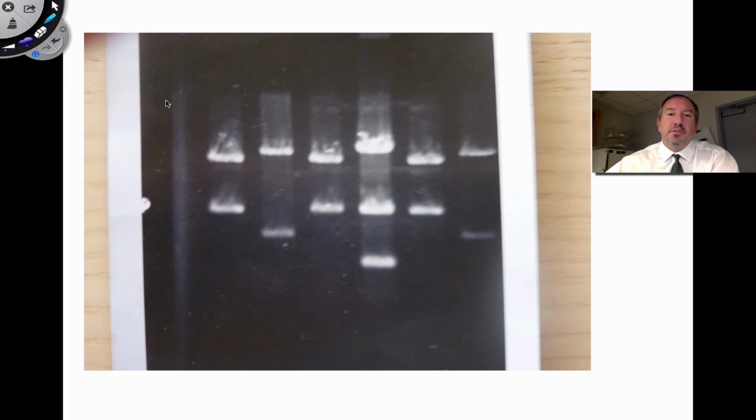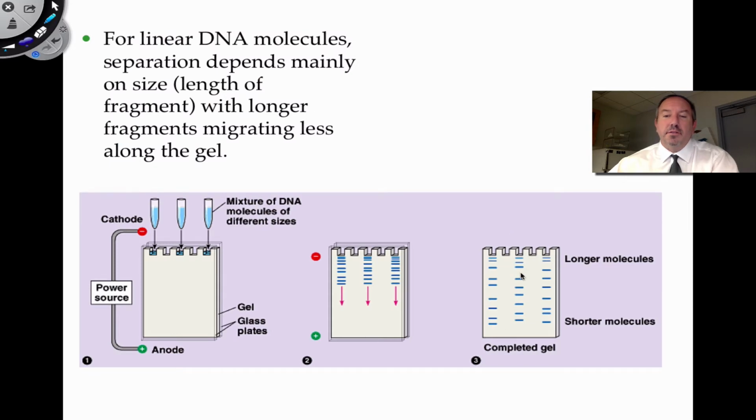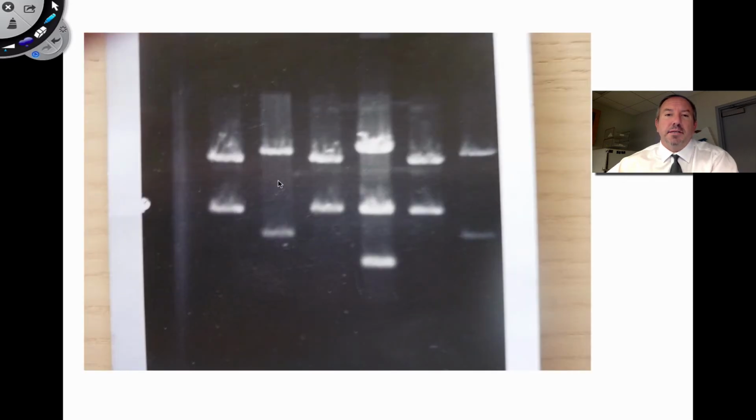I just wanted to show, this is an old sort of retro photograph. If you don't recognize this, since it is kind of an older picture, it's actually a Polaroid picture. This is a picture that I took in my lab many years ago using literally a Polaroid camera on top of the gel, so you can literally see these banding fragments here, and you can make some comparisons. Like, for example, just to give you an example, if I were to separate it like this and make it a little bit easier, you can see that this particular DNA has been digested.